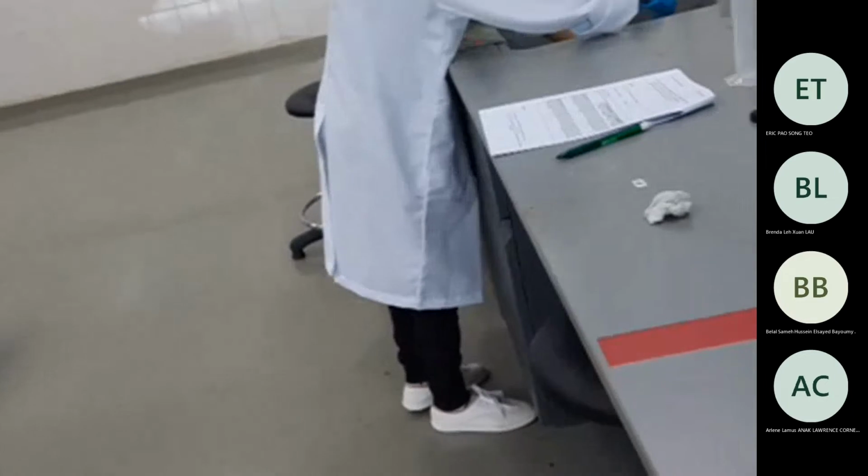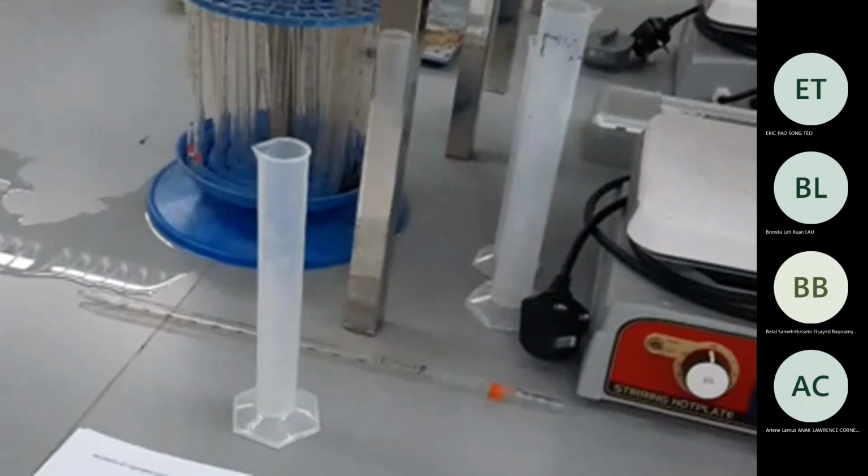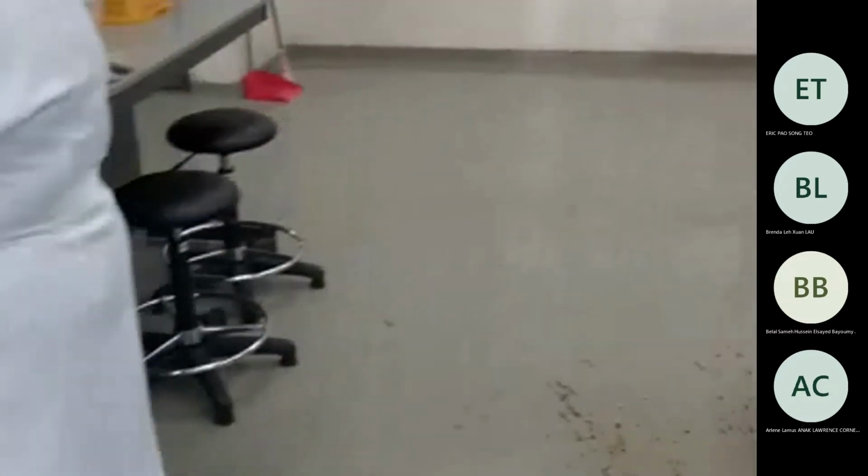And another thing, what I was saying. For all of your friends, they are doing these things. You see that the final pH for the buffer is almost similar to each other: 4.67, 4.68, 4.64. Which is in contrast to the previous one, which is much different. So you have to discuss this in the discussion, why, how, what is happening actually, and what are the theories, all those things. So online guys, do you have any questions?